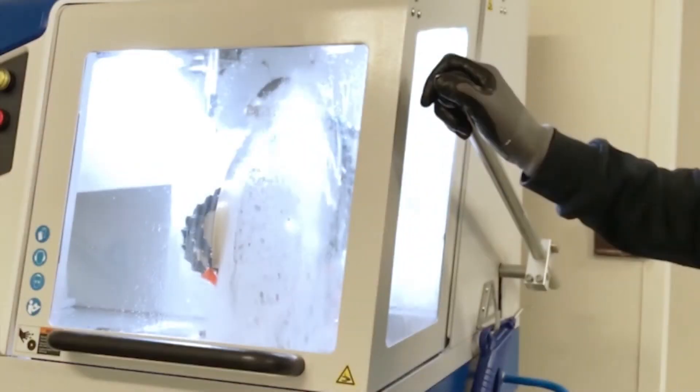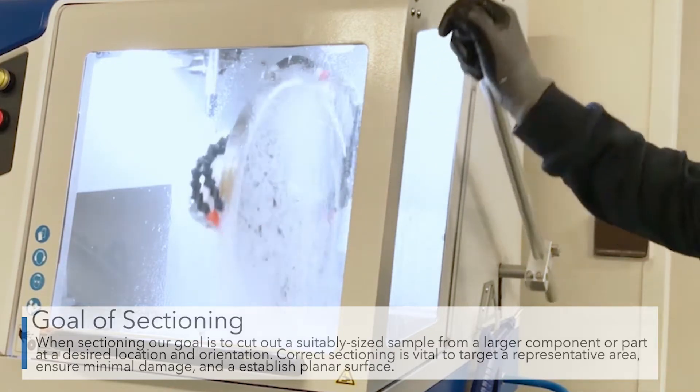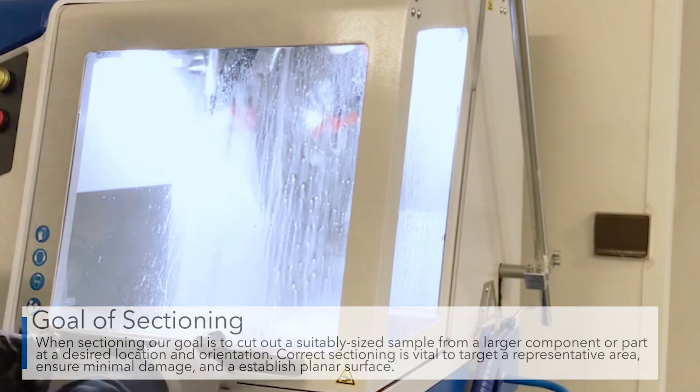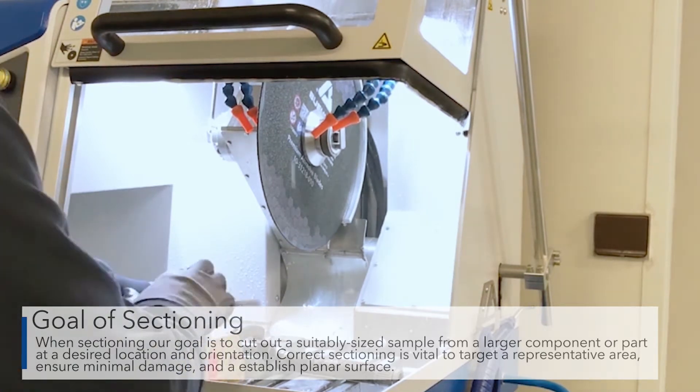When sectioning, our goal is to cut out a suitably sized sample from a larger component or part at the desired location and orientation. Correct sectioning is vital to target a representative area, ensure minimal damage, and establish a planar surface. In most circumstances, this is best done with a Buehler abrasive cutter.